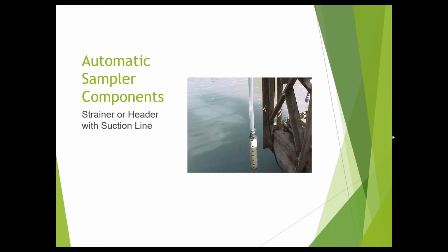Okay. And I've also had my sampler fail, and you just have to do it again. I have a question from Mr. Adeboale Sanwo. If your flow is intermittent and you're using a flow proportion sampler, how does 24 hours work? So if your flow is intermittent, generally the facility will know how much it discharges in 24 hours. It will have those records. And you go back and you look at the records.